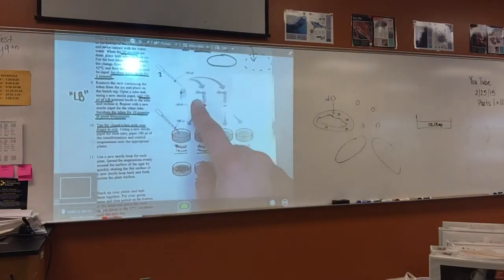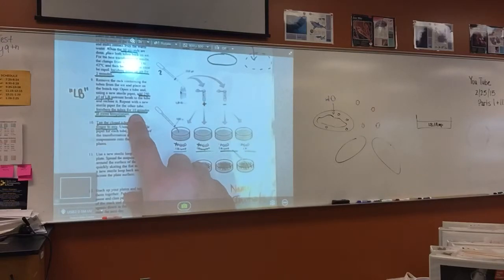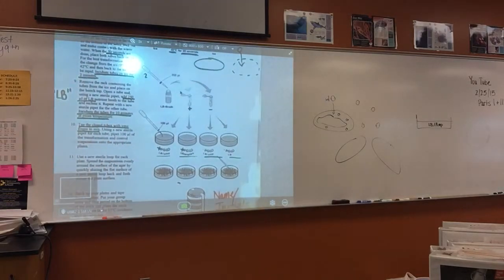After you do that, you let it sit for 10 minutes at room temperature, so you have some more downtime. After that 10 minutes, you tap it. It says tap the closed tubes with your finger to mix. Let me explain what that looks like. It's like this. What you're doing is mixing the solution down below.